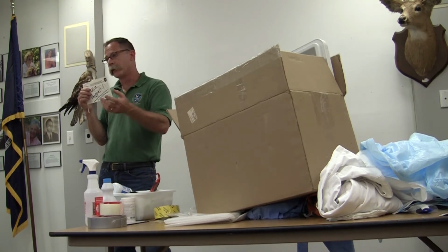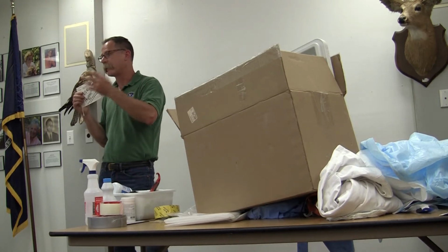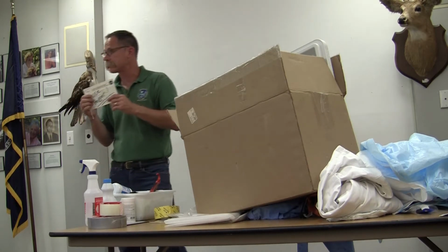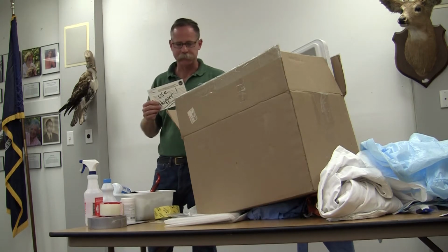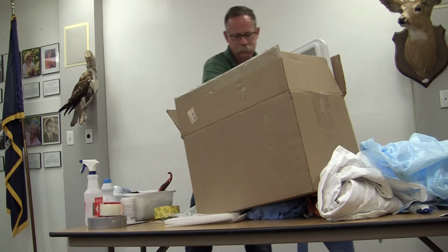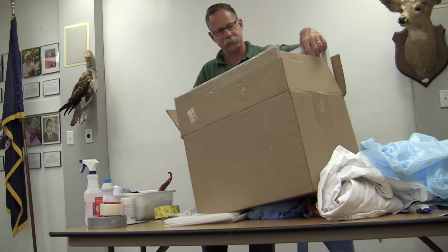But I really want to know exactly what you guys put in there, because there might be clues in there that are going to send us in a direction that we might not have looked in before, just based on something you said in your history. So if you use the hopper, your entire history goes in there verbatim the way that you type it in. So before you hit submit with that system, print out a copy, attach it to the bag, and that will keep it from getting mixed up if there's other stuff in there.